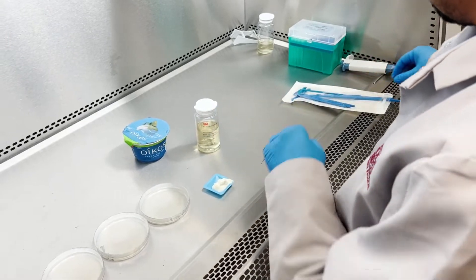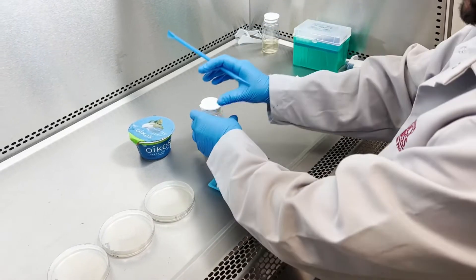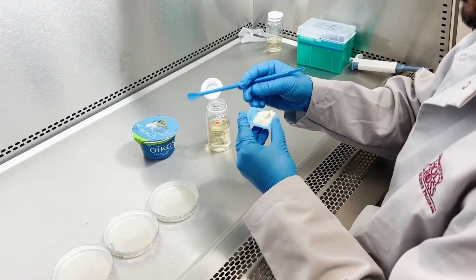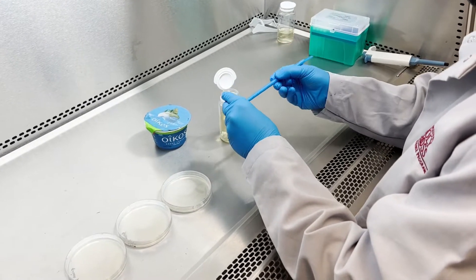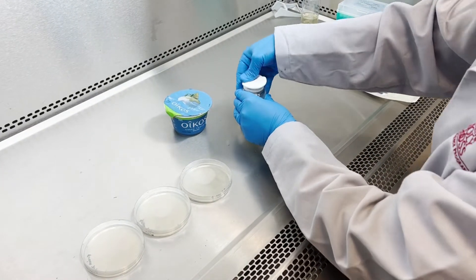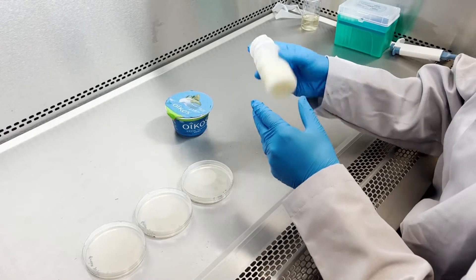So I'm going to take the electrolyte scoop and add 10 grams of yogurt sample which I already weighed. After that I'm just mixing it well.